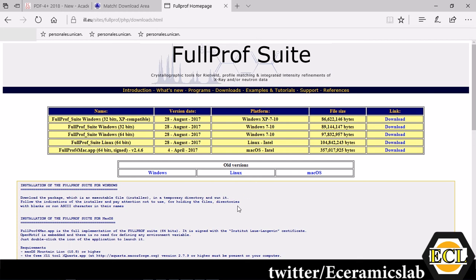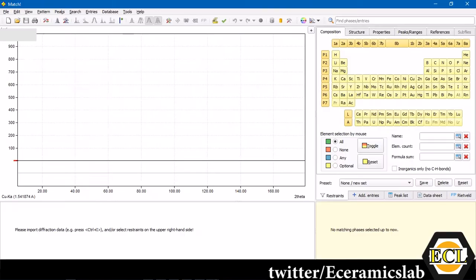We'll move over to the MATCH software and we'll see how to do the Rietveld refinement, automatic Rietveld refinement for a powder diffraction data of strontium titanate powder. This is the MATCH software. This is how it looks like.